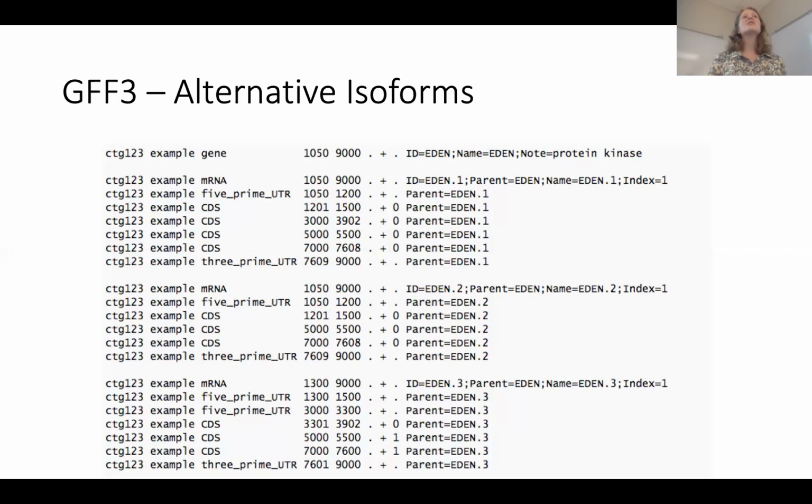We generally use the GFF that comes off of the BRAKER pipeline, so we've started using BRAKER for gene annotation, and there's MAKER and there's BRAKER. I think when BRAKER came along, that was a play on words against MAKER, the original genome annotation program. We just use what comes off of BRAKER. When we're downloading from NCBI even, these are very non-standard. The parent terms are not named the way that makes them identifiable in the database.